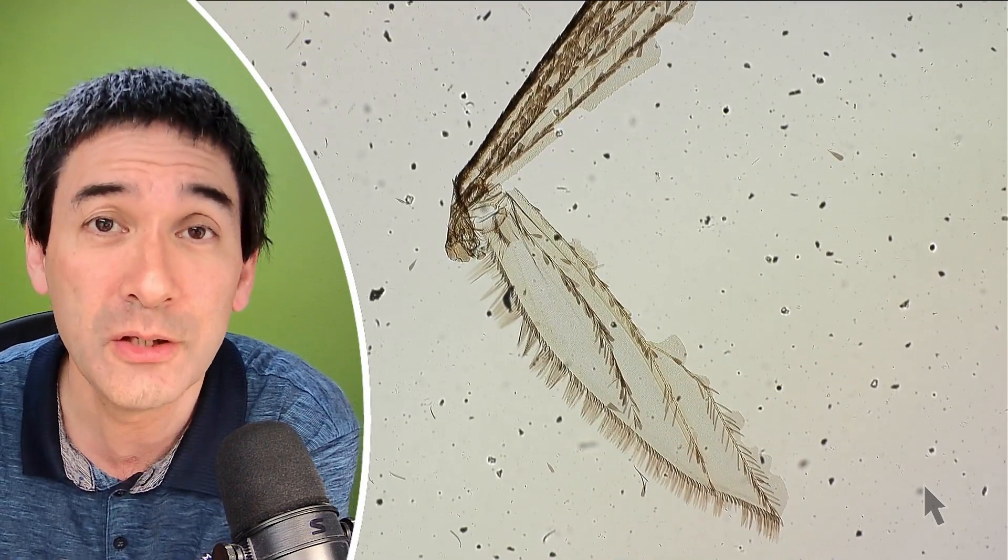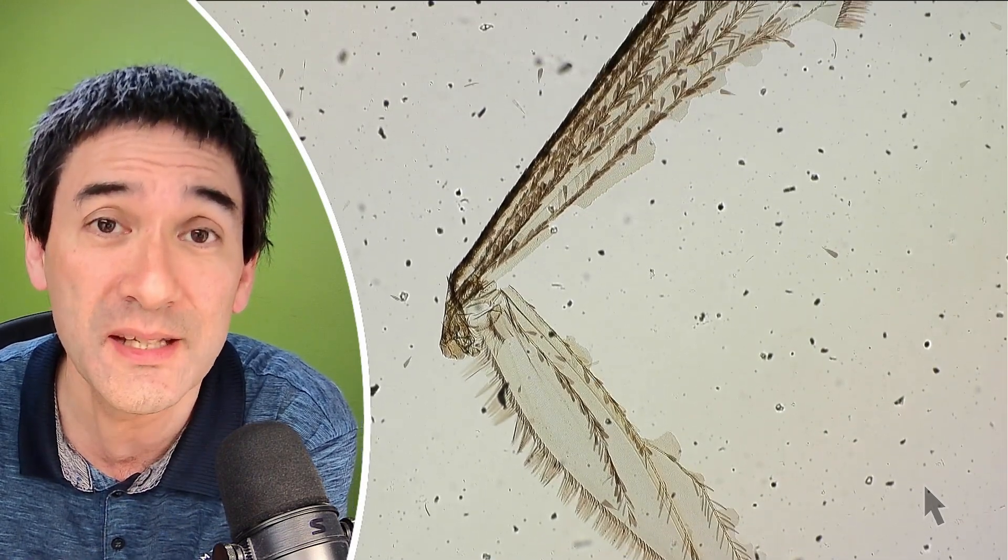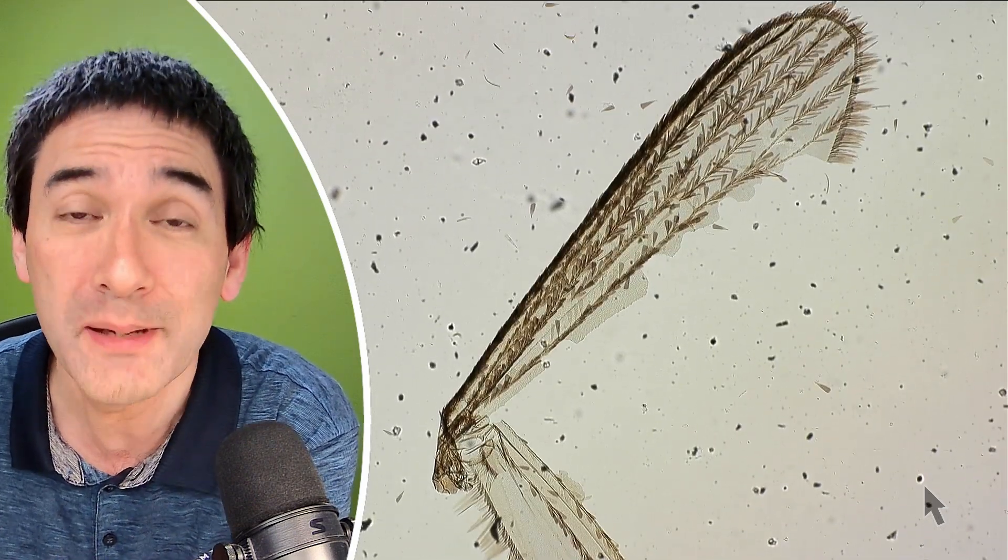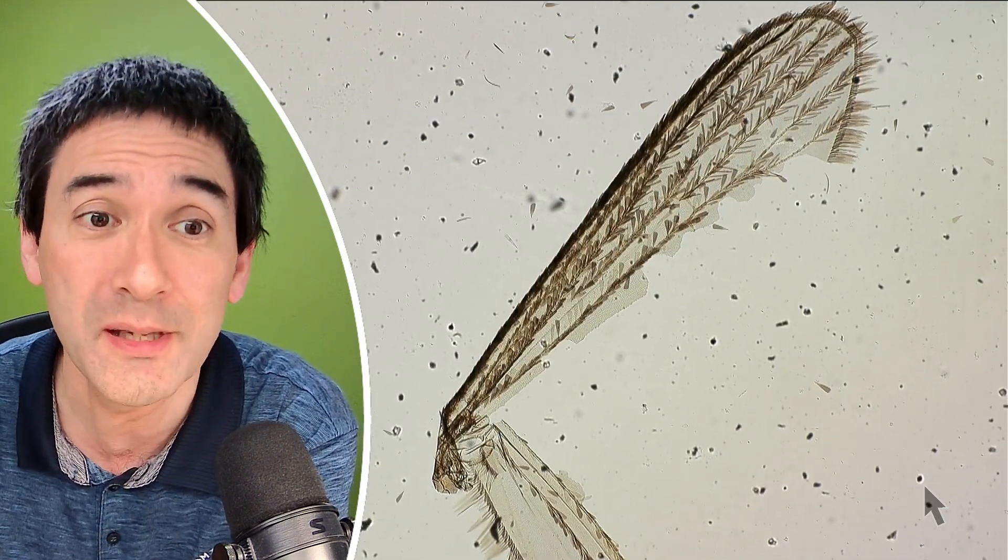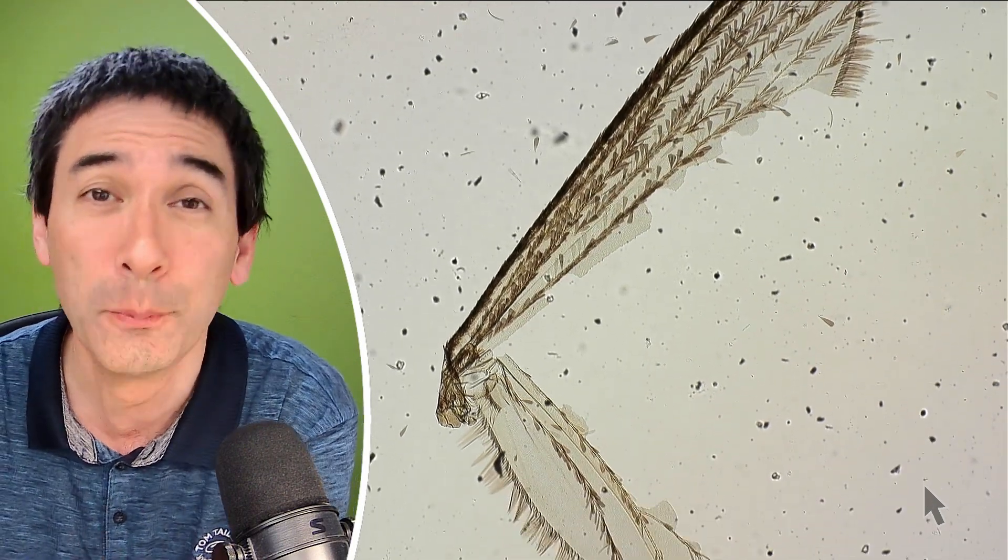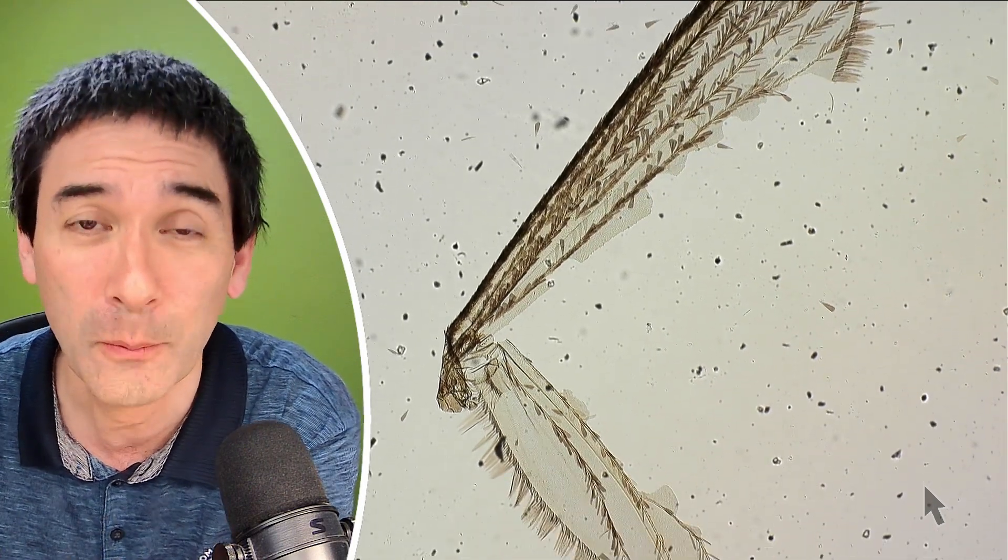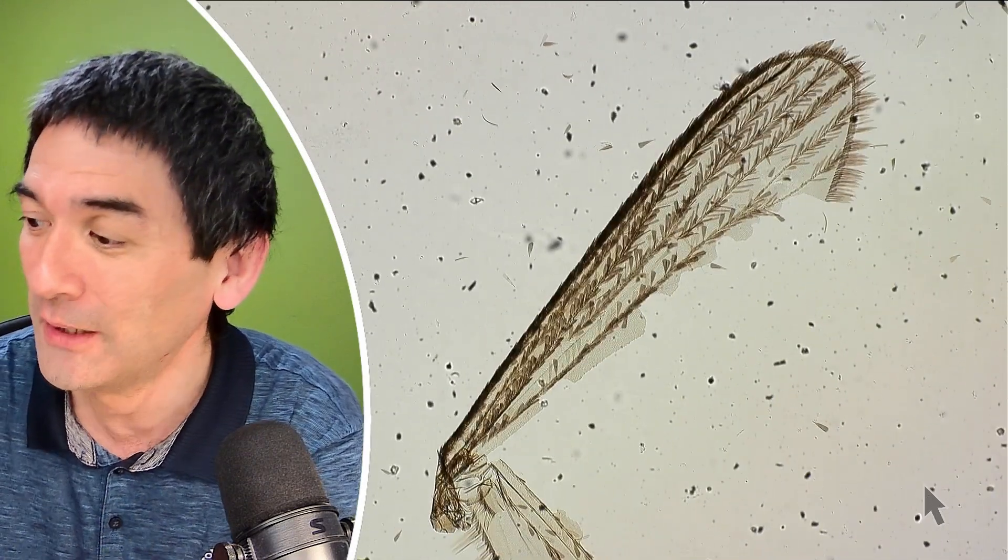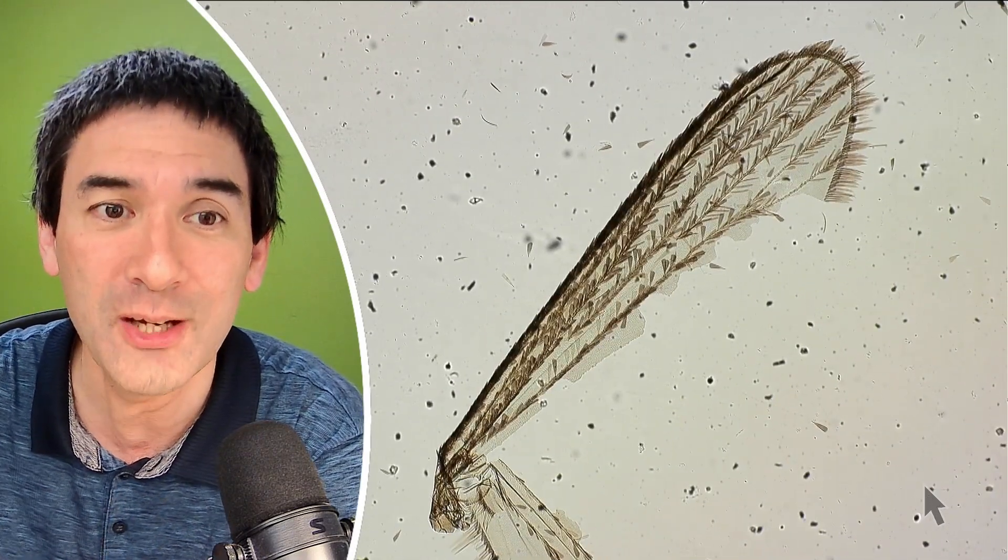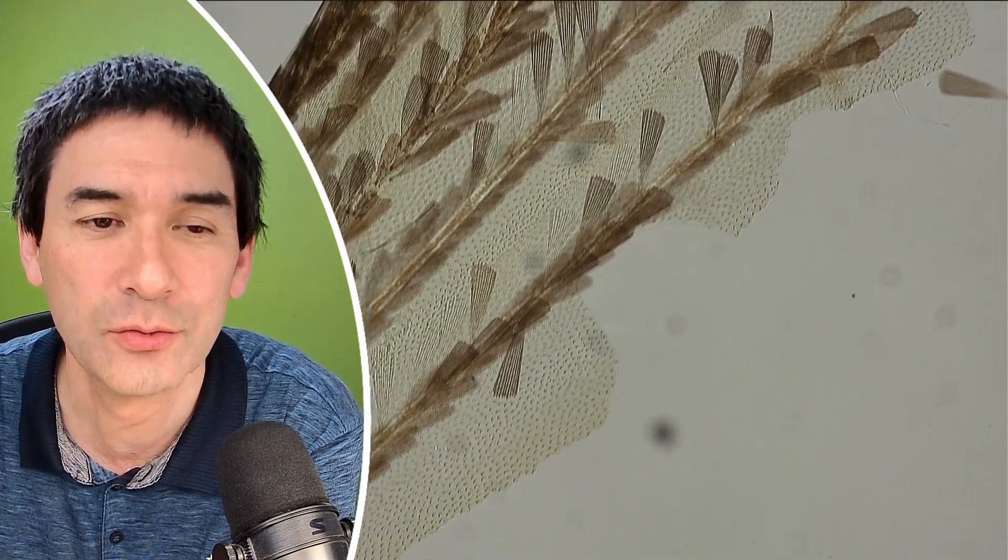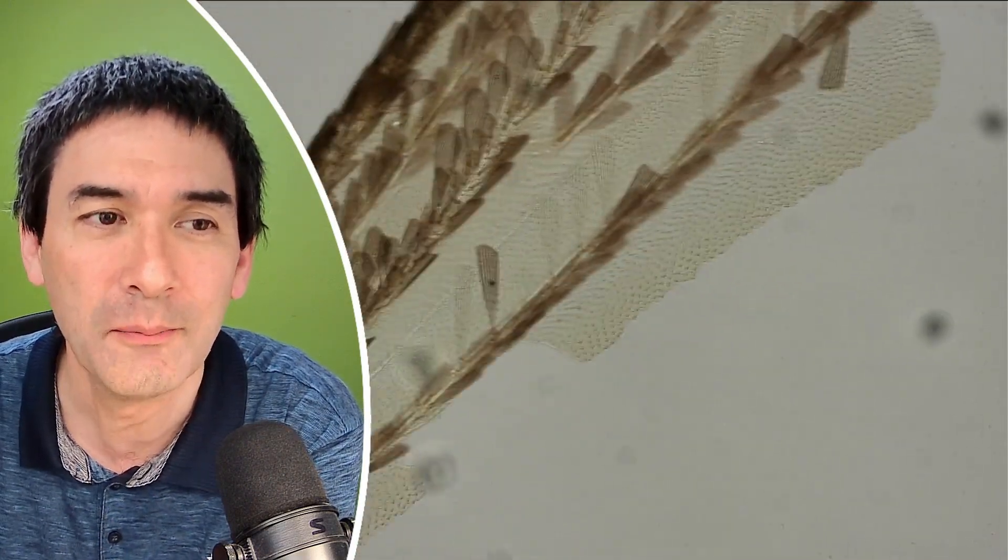In this case, the mounting medium, the UKIT mounting medium, in this case, evidently was not very suitable. That's one of the reasons why you have different mounting media for different specimens. UKIT is, again, suitable for other specimens, but normally for insects and insect wings, you want to use U-Parle. I think that's a completely different topic for a different video. Let's just go up with the magnification a little bit. And here we can see again how it's ripped and torn. You get the idea.